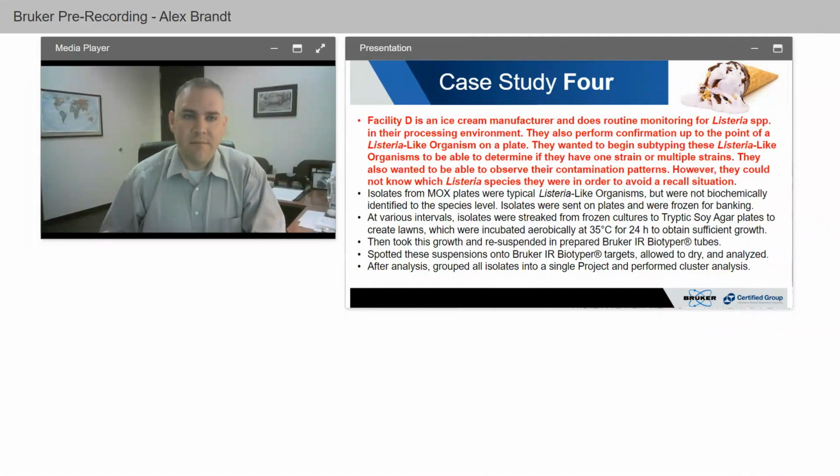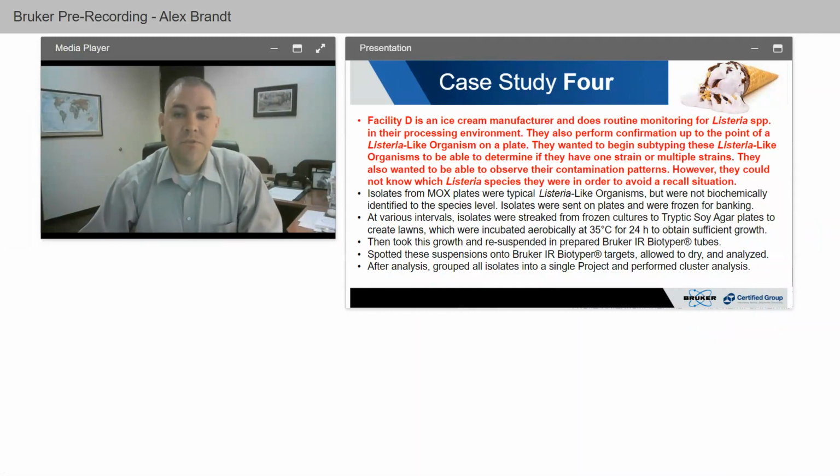So our last case study is with Facility D, which is an ice cream manufacturer that does routine monitoring for Listeria species in their processing environment. They also perform confirmation up to the point of a Listeria-like organism on a plate. And so they wanted to begin subtyping these Listeria-like organisms to determine if they have one strain or multiple strains. And they also wanted to be able to observe their contamination patterns. However, they could not know which Listeria species these isolates were, again in order to avoid a recall situation.